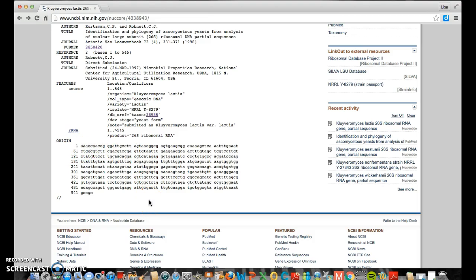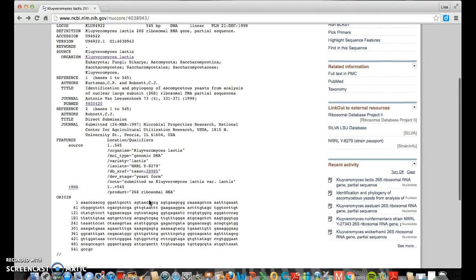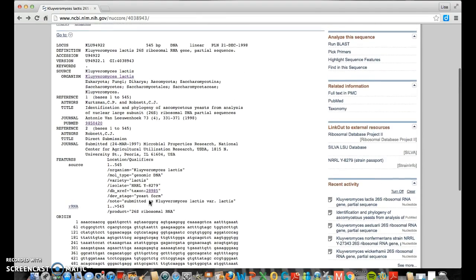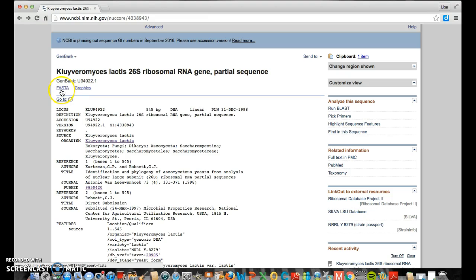This should look familiar to you. A's, C's, G's, and T's. This is the DNA sequence for the piece of DNA that has been sequenced for Kluyveromyces. What we're going to do is we're going to, instead of typing the A's or copying and pasting A, C, T, G, we're going to do a shortcut. So we need this file, this FASTA, that's how it's pronounced, FASTA file.